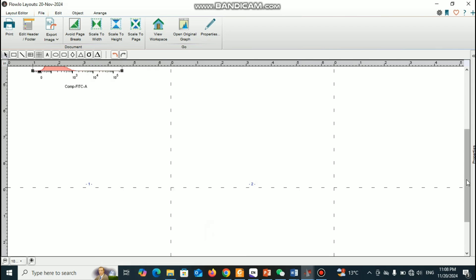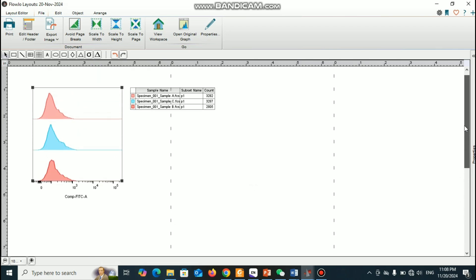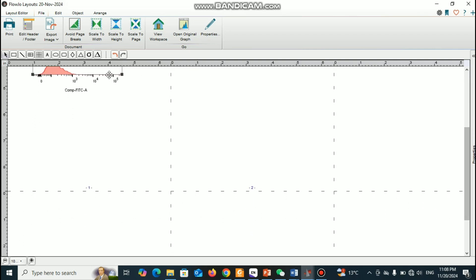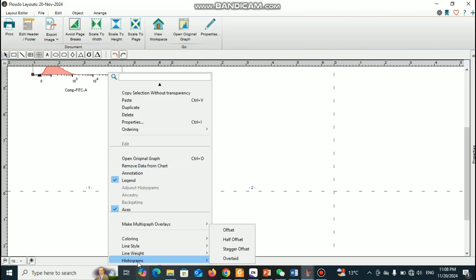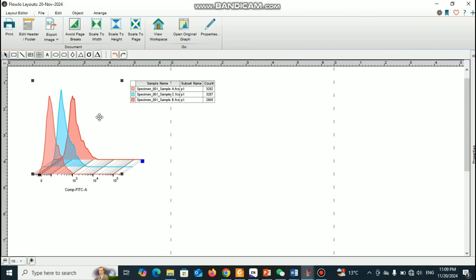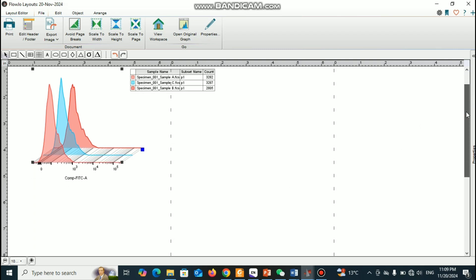Now you can see the histogram. If you click 'Offset' you can see it changes — this is another kind of representation. If you want to present this data you can copy the selection, export from here, and also you can change to 'Stagger Offset' if you want that kind of data set. You can see it changes to a different kind of representation.